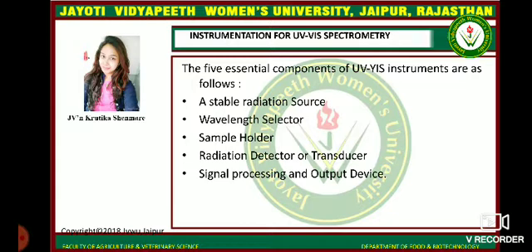Instrumentation for UV visible spectroscopy. The five essential components of UV visible spectroscopy are a stable radiation source, a wavelength selector, a sample holder, a radiation detector or transducer, and a signal processing and output device.